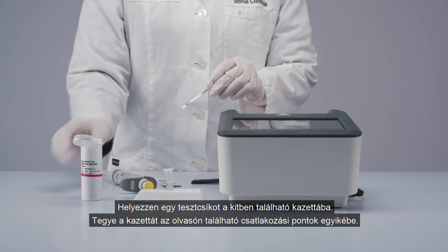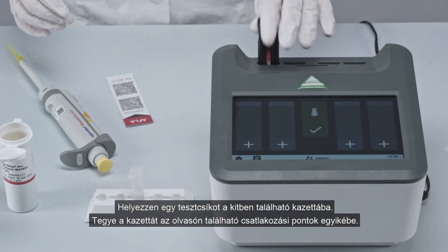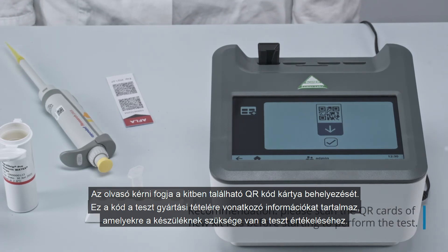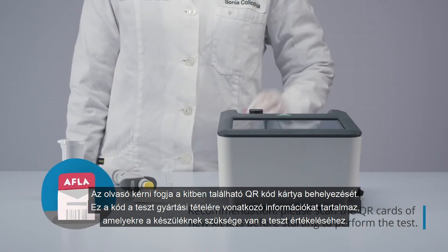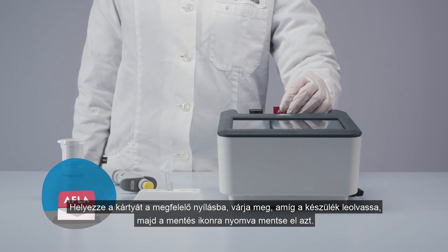Insert the test strip into the provided cartridge. Place the cartridge into an available reader port. You will be prompted to insert the QR card that came with your kit. This contains lot-specific information that the reader needs to carry out the test. Insert it into the designated slot.